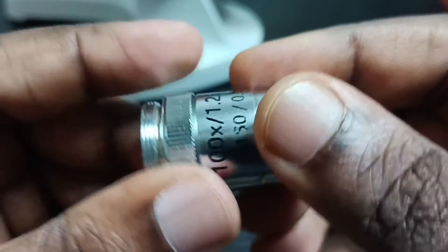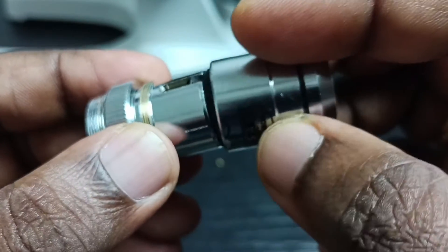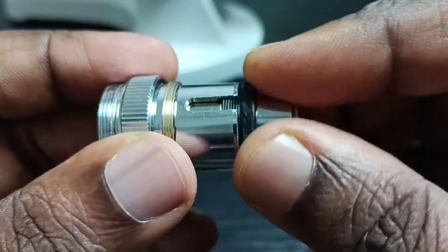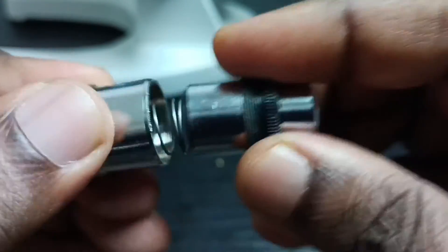So this is just an example — I have to clean it, that is why I didn't put that screw in. This way we can open the optical lens of a microscope and clean it. I hope you have enjoyed this video, please check it out.